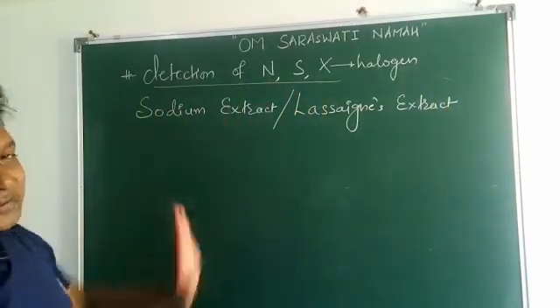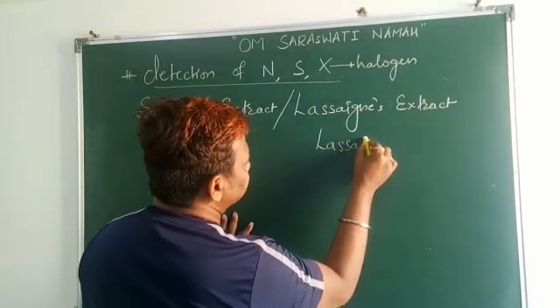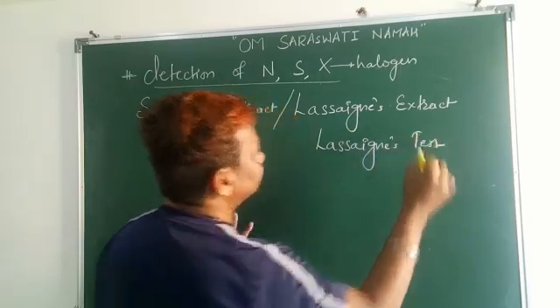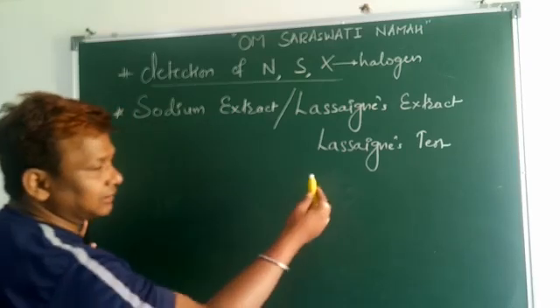Sodium extract, Lassaigne extract, and this particular test will be called the Lassaigne test. So we will see now how to prepare this sodium extract or Lassaigne extract for the Lassaigne test.